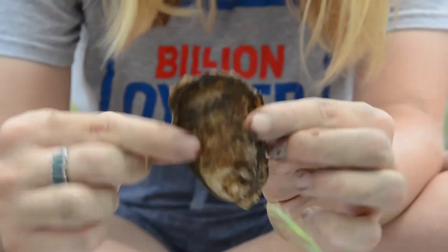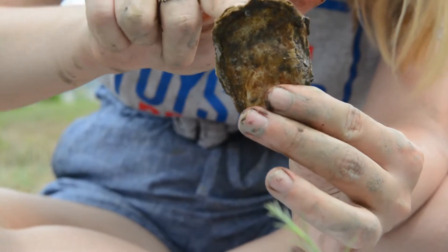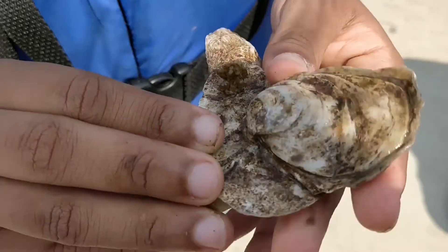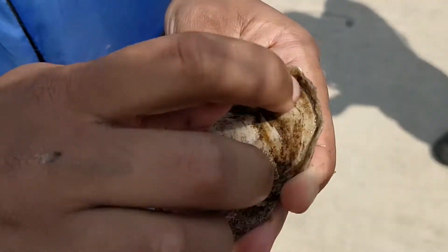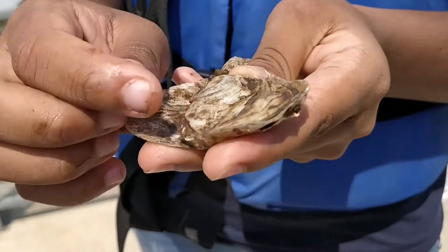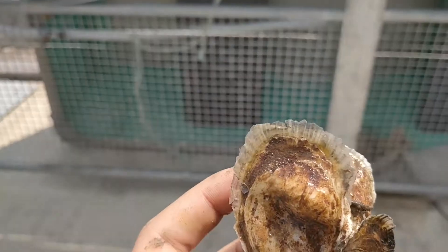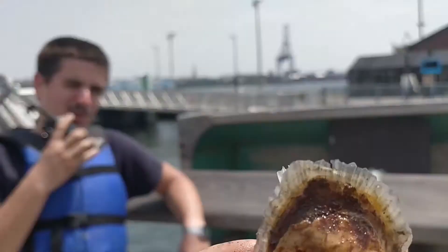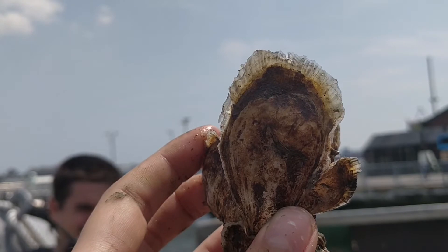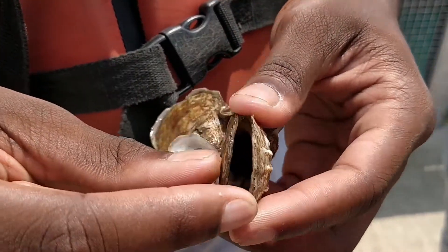To identify live and dead oysters, check if it has two shells and that they are sealed. If the oyster has some weight to it, it's also a good sign. Sometimes muck can seal the oysters, so lightly pry at the bill of the oyster. If the seal remains intact, the oyster is alive. A thin, translucent shell at the edge also indicates new growth on a live oyster — warning, this could be very sharp. A dead oyster will be open, without an oyster or new growth.